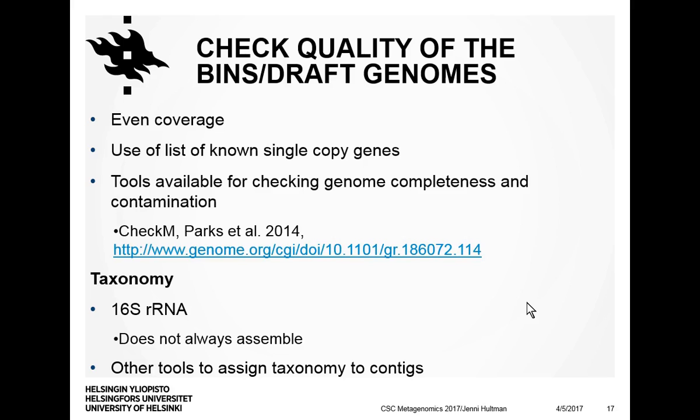And then what you can do is to do this manually or use different tools that are available for checking the genome completeness and contamination. And my favorite for this is called CheckM. It was also easy to install on Taito, and there you get nice information on the presence of single copy genes and then the genome completeness.